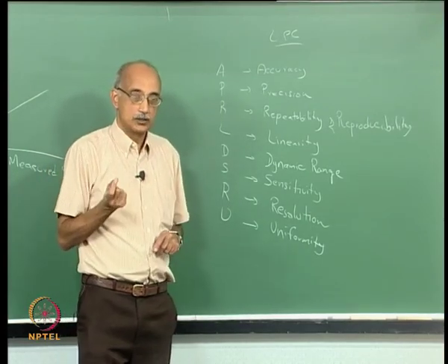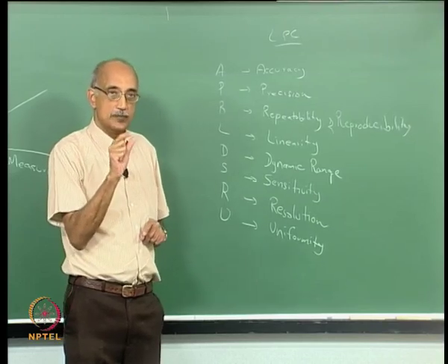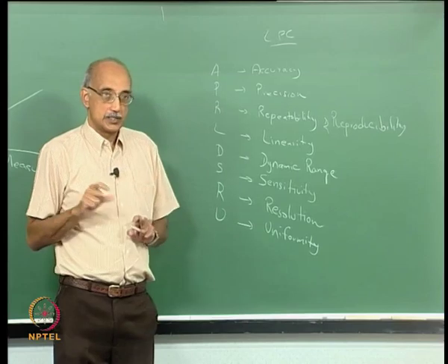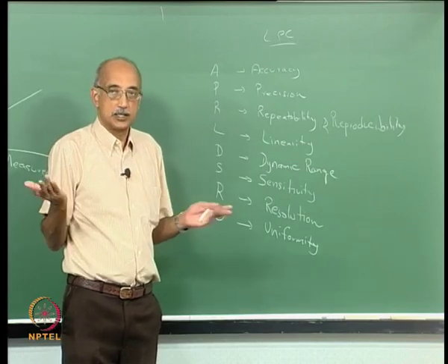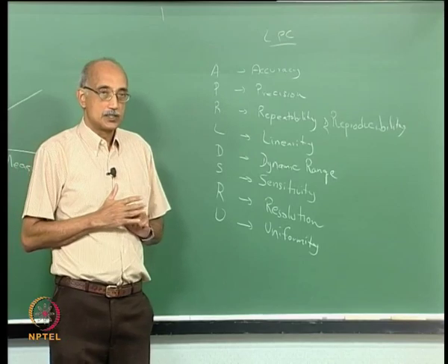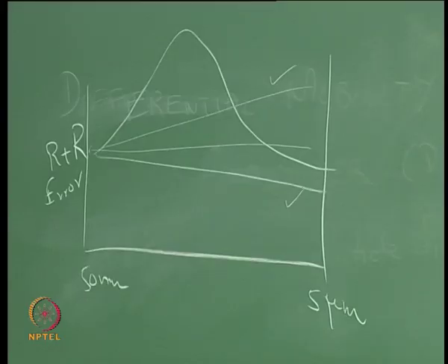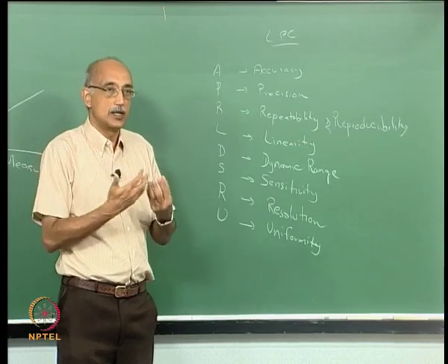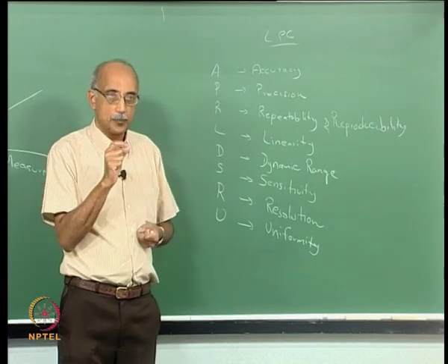Resolution, on the other hand, is slightly different. The resolution is a measure of how closely two particles can be positioned in the sample but still be measured or identified as separate particles. Now that number typically will be larger than the sensitivity parameter, and so an instrument that can measure down to 5 nanometers may not be able to distinguish particles that are, let's say, 10 nanometers apart, in which case there's always a question mark over the data. When it says 5 nanometers, is that really 5 nanometers or not? And especially in the larger sizes, if such an instrument is measuring, let's say, 100 nanometers, you are not sure if that is 250 nanometer or 10 nanometer sized particles or really 100 nanometer particle. So resolution refers to the ability of the instrument to tell a single particle apart from an agglomeration of particles.